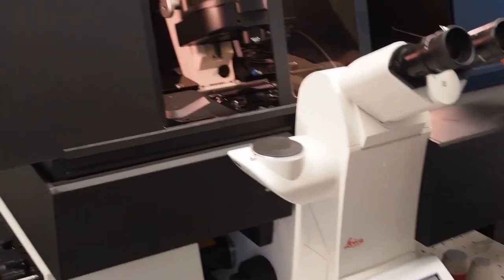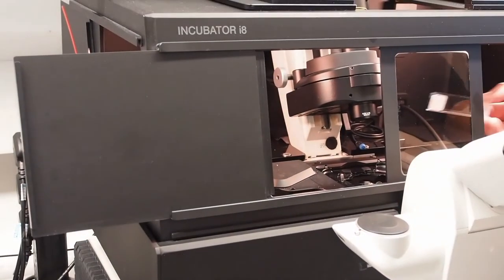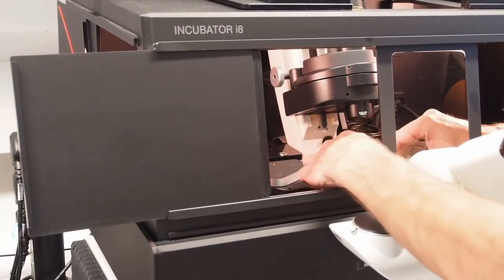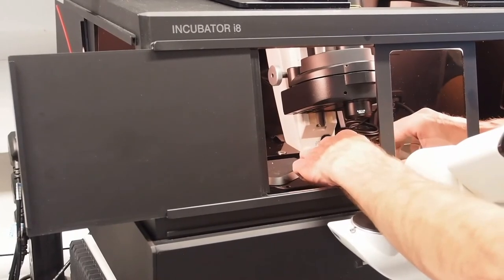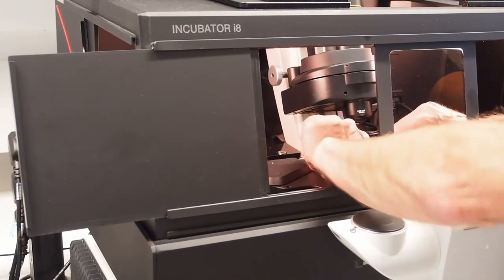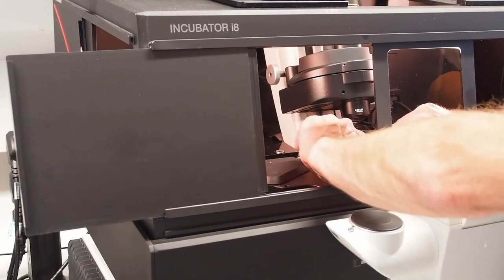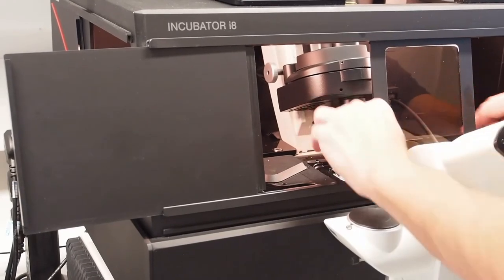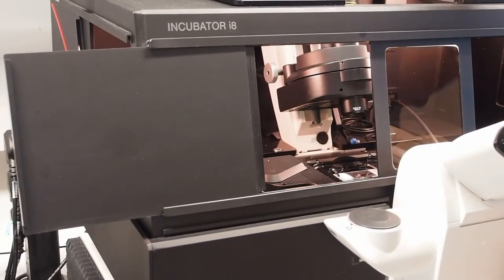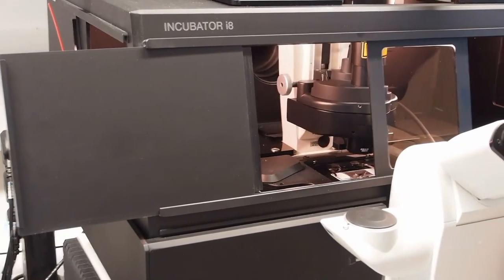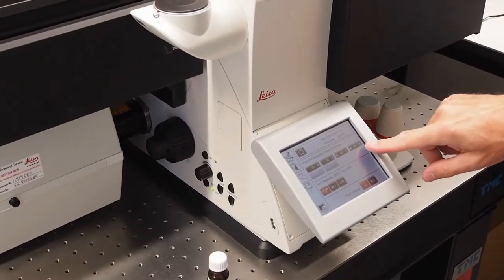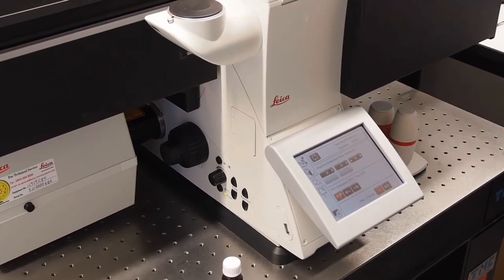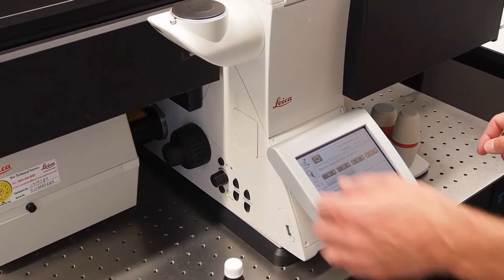Place the slide back on the stage upside down. Make sure it's secured and bring down the condenser. On the touch screen the 63 is flashing and press it again and it will come up to focus.